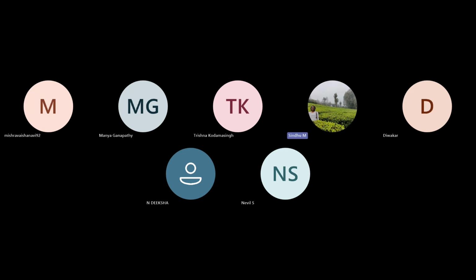Here, you're just telling the software what file name to use when you're saving it. I'm leaving it blank and I'm just selecting 2 digits here. So it will be saved as 00.tif, 01.tif, 02.tif, like that. And if you want to save it in a different format, you can select that as well. Right now I'm saving it as TIFF because I don't want any data loss. And here you can select which folder you want it to save in. So it should be saved here now.